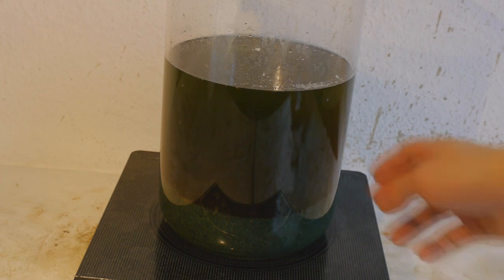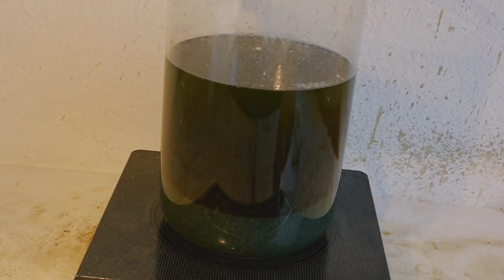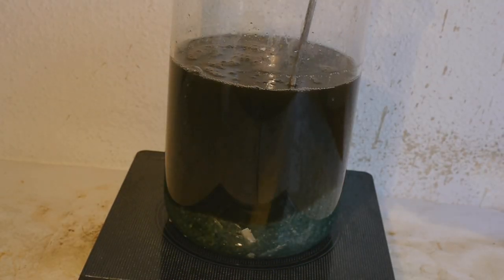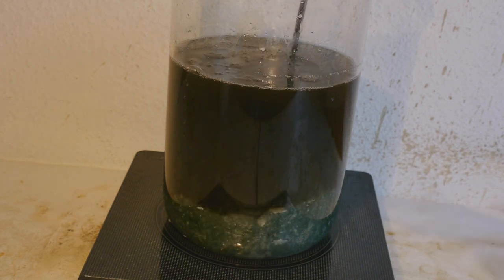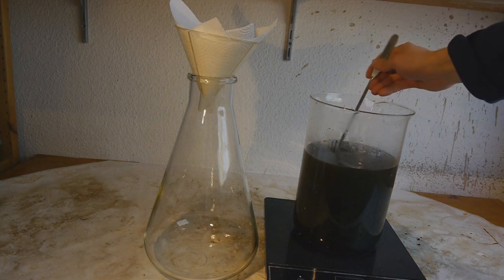The next step is to heat this until all these crystals down here are dissolved. It's also a great idea to stir this, otherwise you'll get anhydrous iron sulfate like that underwater, which is quite interesting. Most of the iron sulfate has dissolved now.